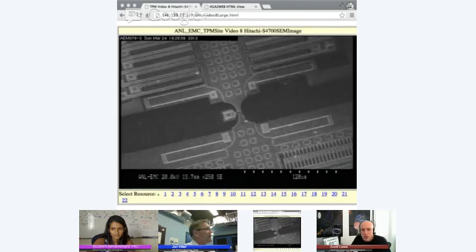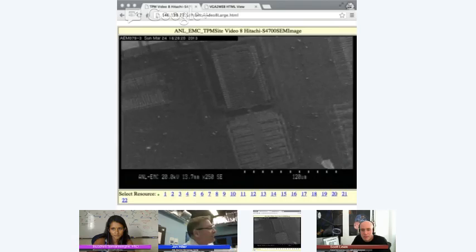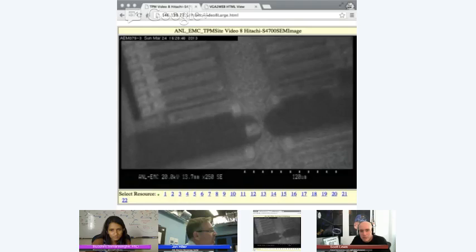I'm going to go into low magnification mode here, and if you look at this device, there are a multitude of, I'll call them springs, on the bottom and the top side. There's a few hundred of them. When there's a voltage applied to them, they will actuate. Depending upon the voltage depends upon how much you pull, how much force you exert. These springs all work in unison. It was designed at Northwestern University.